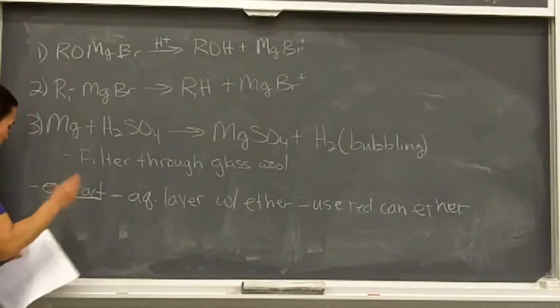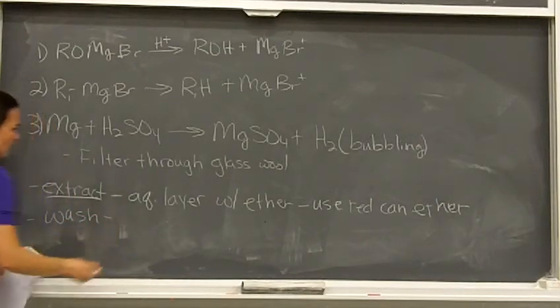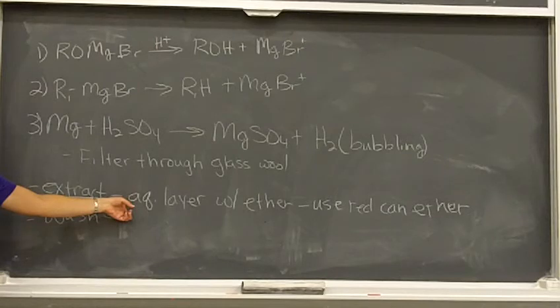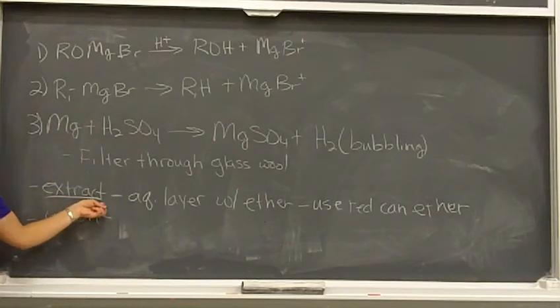Okay? In extracting, that means we're going to have our aqueous layer, add ether, shake, vent in your separatory funnel, and separate the two layers. All of that is implied in extract.